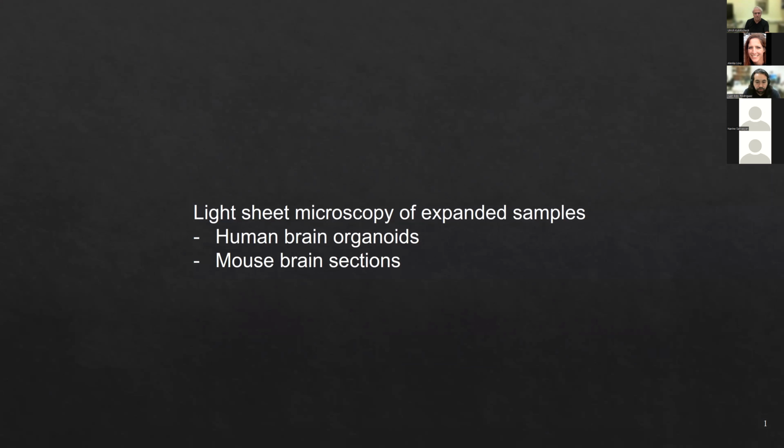I will show you 2 examples or 2 applications. The first one will be with human brain organoids.